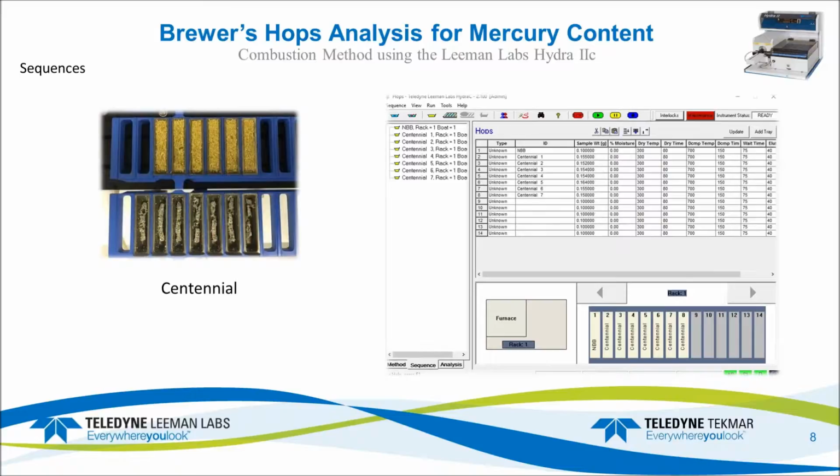As the samples go through the process, when they're loaded up in the boats, as the last boat in the last rack finishes, it gets pushed off onto some forks so that the next set of boats can go into the load up position.